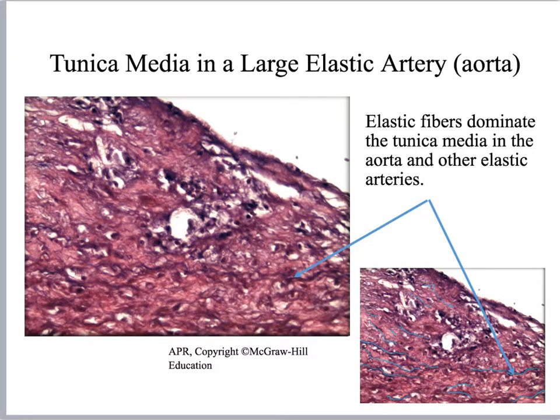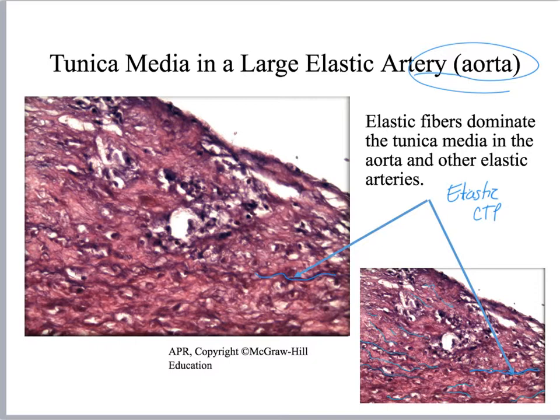Here we're looking at slides from your APR, specifically the tunica media of the aorta. What's nice about this slide is the staining, where you can see fine lines that highlight the elastic fibers of elastic connective tissue proper. Elastic fibers are very hard to see in most tissues — they have to be specially stained. In AMP 1 we didn't have great slides for elastic connective tissue proper, but this one is actually pretty decent.